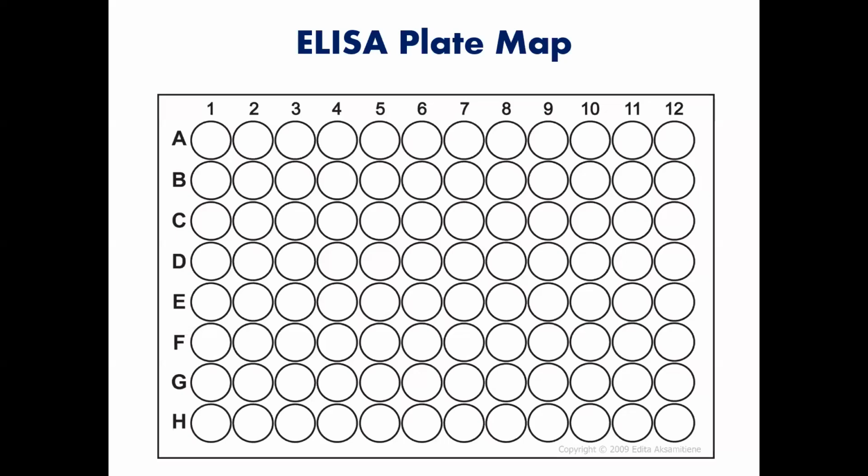And that goes when you're developing the assay to test. If I wash 2 times, what do I get? If I wash 4 times, what do I get? If I wash for 3 minutes, what do I get? If I wash for 2 minutes, what do I get? Some of them will be washed off, but some will remain. So you want to make sure that whatever remains is the right thing and you don't wash everything off.